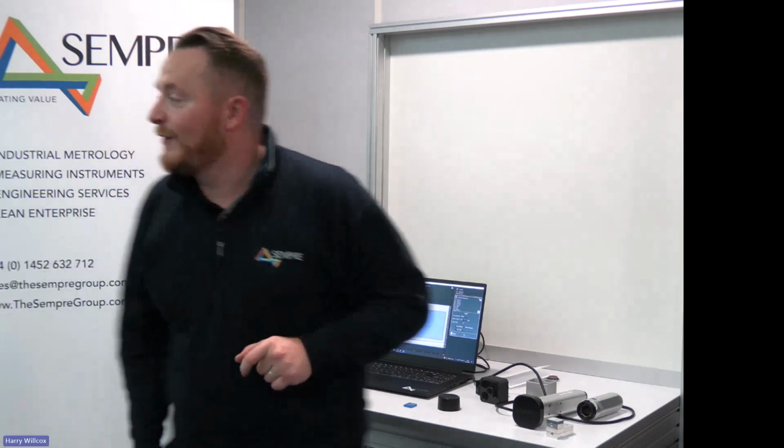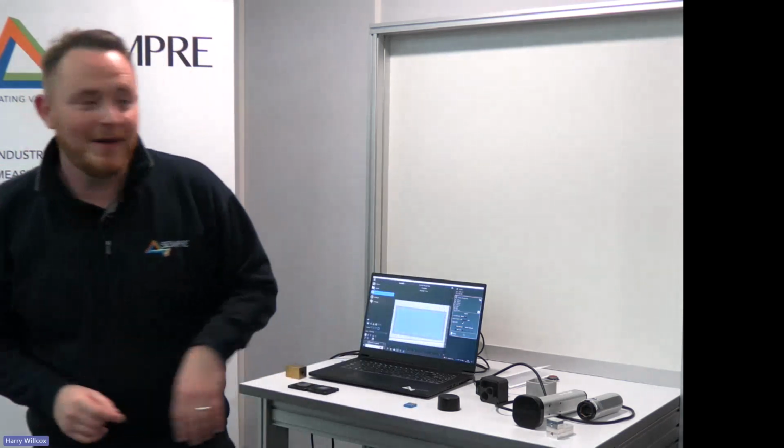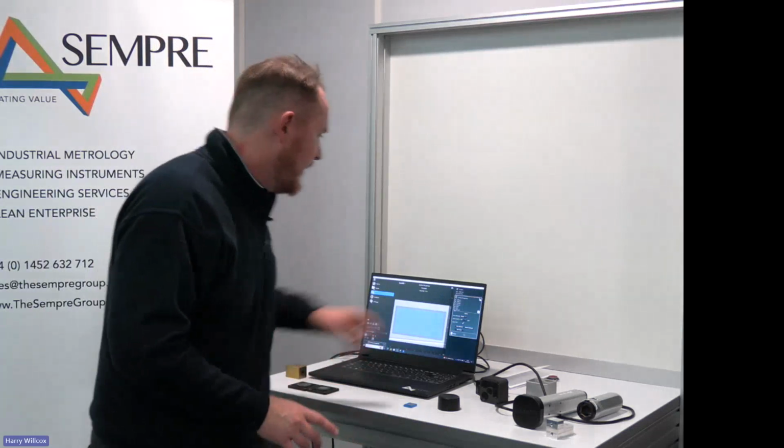I think that's probably all the questions that we're going to have. All right. So, oh, one more, sorry. Oh, yes, of course, I missed the question. I was rambling on. So the pads themselves, the pad cost is probably, ballpark figures again, about 125 quid up to about 150 quid. And the reason I say the difference is because it depends on how many you buy. So if you were to come and buy 30 pads, you'll get a slightly better rate per item as opposed to if you were to buy 4. So a ballpark figure between 125 and 150 pounds per pad.